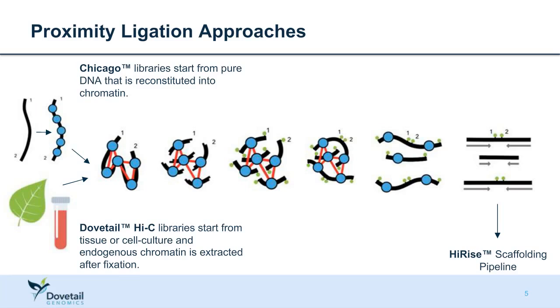So before we move forward, I just want to discuss a little bit about what you might want to consider as a data recipe, right? When you do a genome assembly, it's ideal that you have data representing the genome from different scales, all the way from short, intermediate, to long range. And just to make it clear what we mean by short, intermediate, and long, a short scale from our perspective will be something less than 100 kb. So those will cover libraries with your shotgun data, your mate pair libraries, even long read PacBio, which is already very long, but in this case, from the whole genome perspective, is still relatively short because it's less than 100 kb.